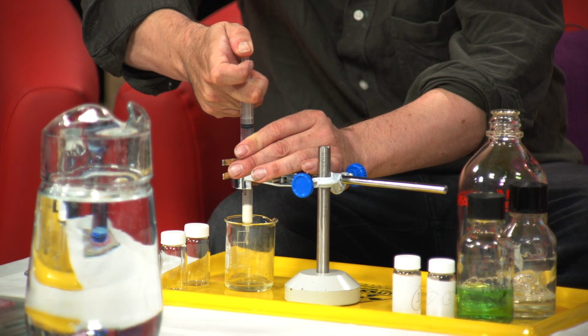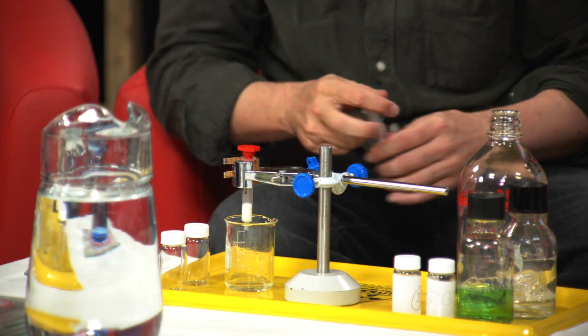and all I'm trying to do is open up the pores in the solid material, such that the second material, which actually is the key one, is this second liquid I'm going to pour through here. I won't get into the details, but what it's going to do is add some sort of charge to the solid material, which will help this separation. So I'll add a little bit of that, and it's basically the same again.